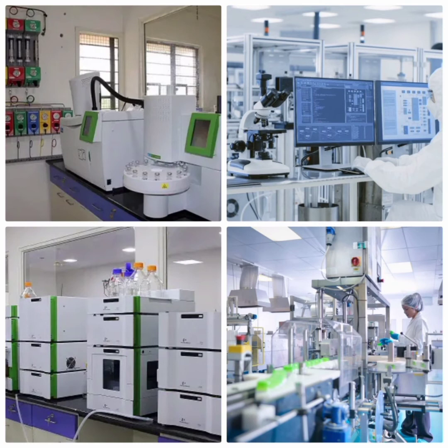For the case of columns, we have seen that the GC column is long and narrow, packed or capillary. The column for HPLC is short and wide compared to GC. For the case of mobile phase, for GC the mobile phase is a pure inert gas, no gradient, and with no pressure. For HPLC, the mobile phase must be a solvent mixture.